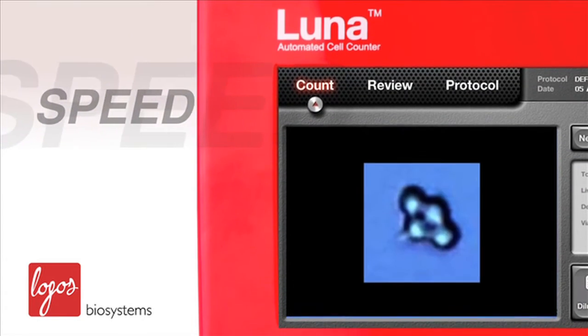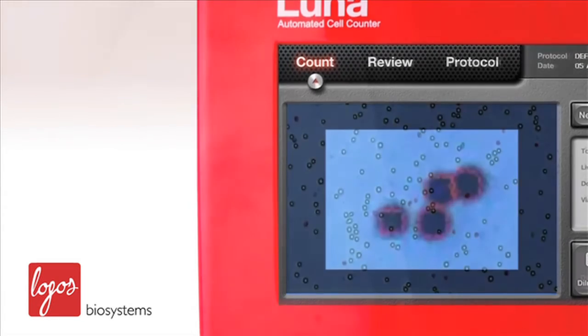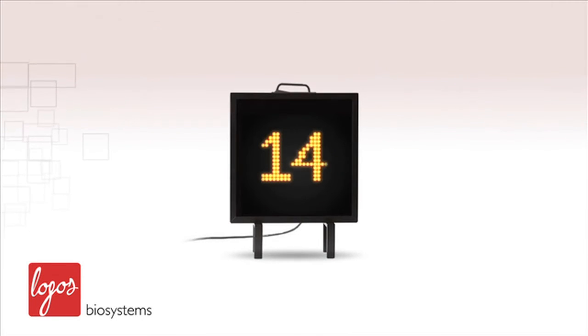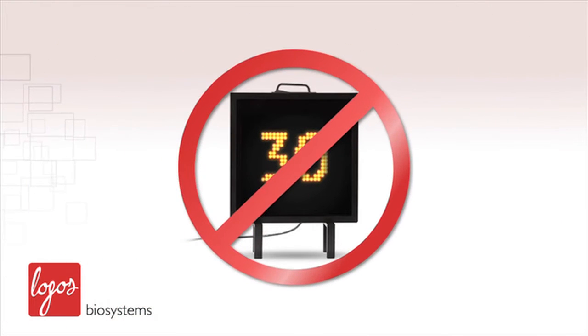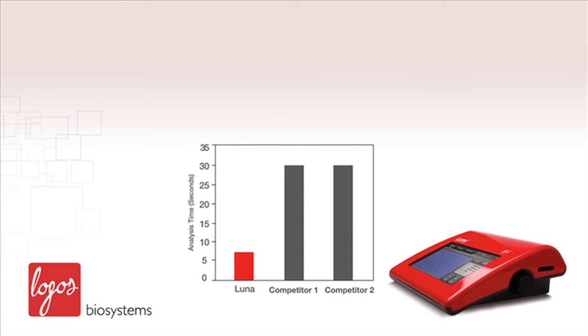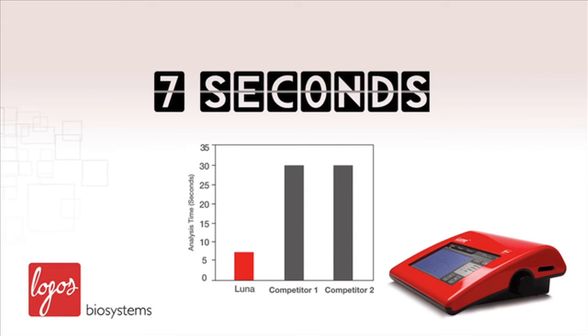The speed of the LUNA automated cell counter will blow you away. All image-based cell counters utilize image analysis software to extract and analyze features of cells, but this process usually takes more than 30 seconds. The LUNA integrates faster computing power to reduce the analysis time to only 7 seconds — about 5 times faster than other cell counters.